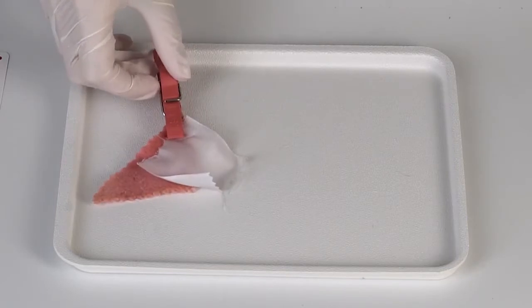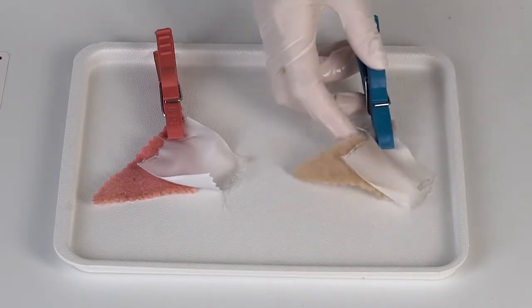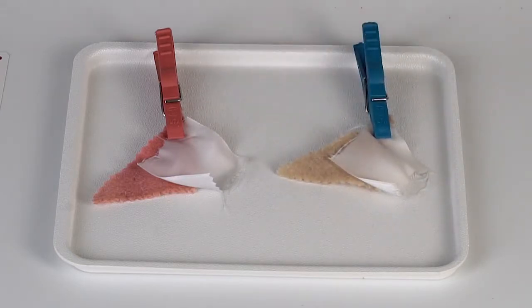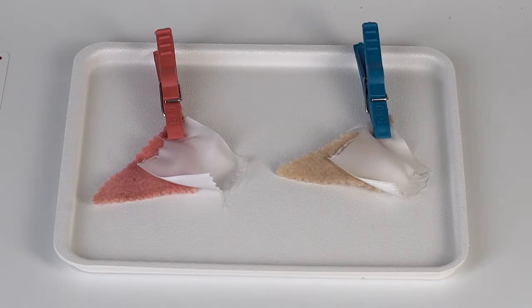As we see, only one piece of fabric remained colored. Unlike carmine, eosin binds to proteins that wool consists of. Polyester does not bind to any coloring at all.